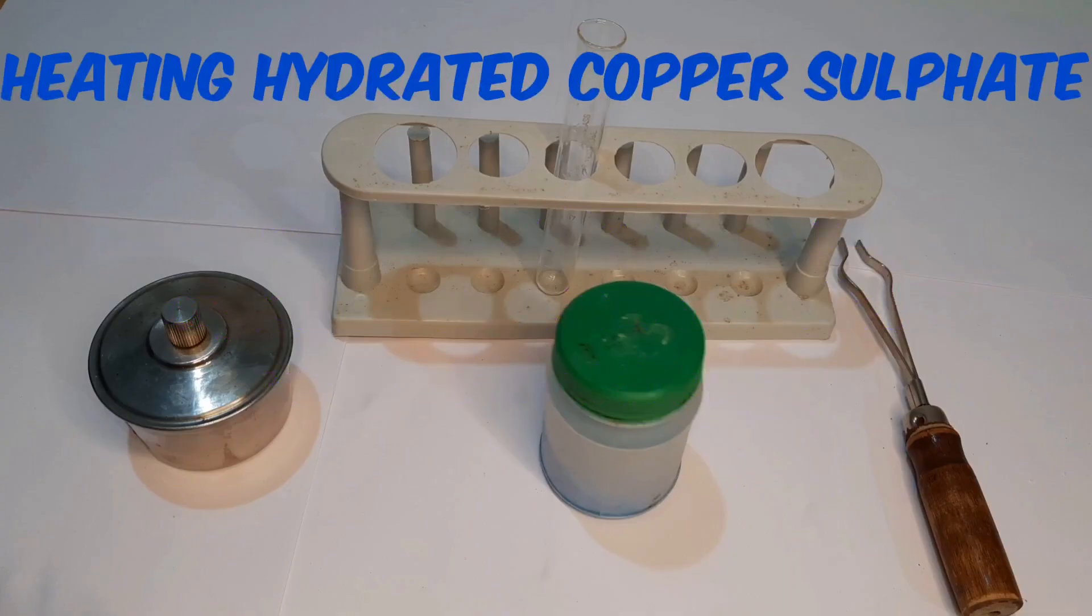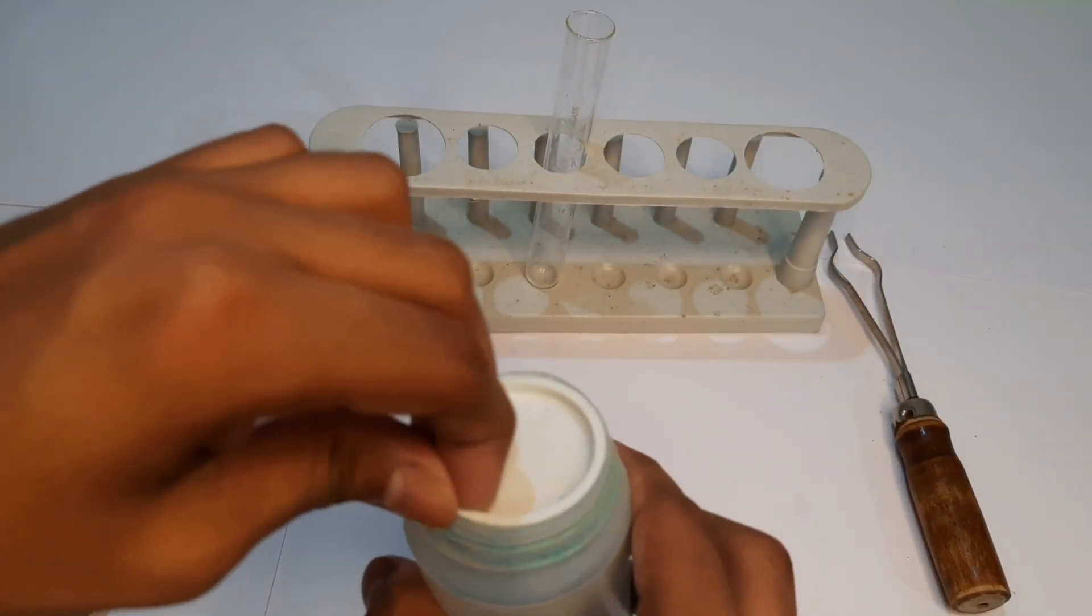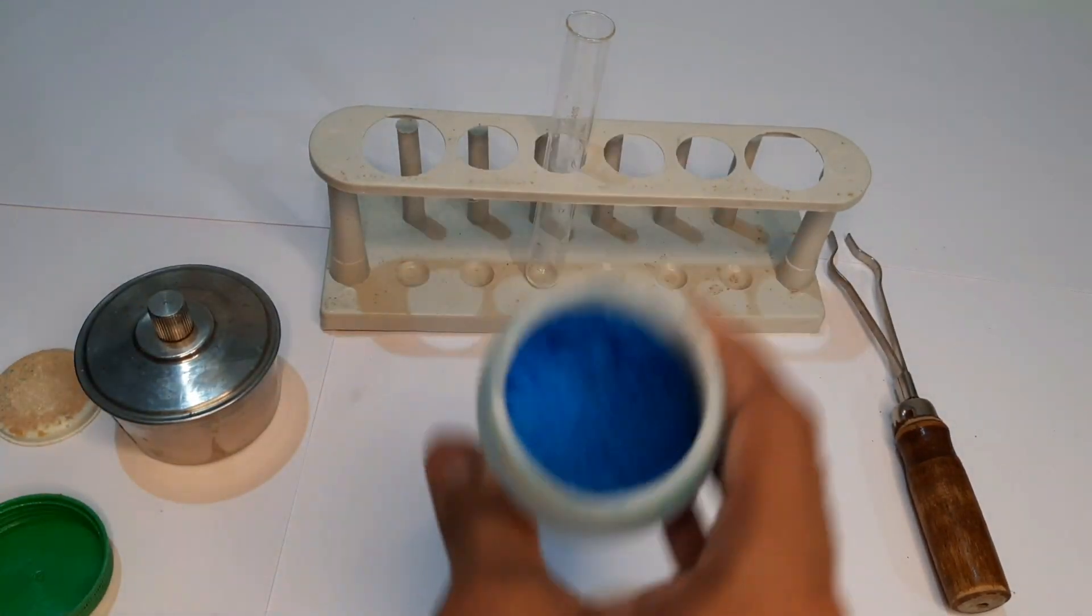Today we are going to see the effect of heating on hydrated copper sulfate. For this activity, take copper sulfate in a test tube which is blue in color.